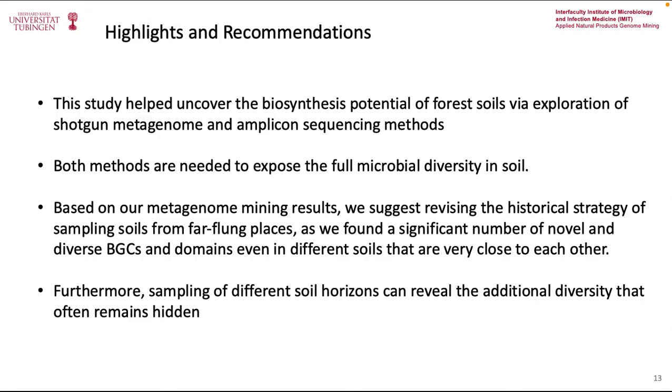So, highlights of this study: biosynthetic potential of the forest soil was uncovered via exploration of shotgun metagenome and amplicon sequencing methods to expose the full microbial and biosynthetic diversity in soil. Both methods are important and needed. And also, we feel that you don't have to go to far-flung places or specifically Bahamas to sample soils. We found tremendous biosynthetic potential in different soils and layers that are very close to each other. We also highlight the importance of studying different soil horizons, as it can reveal the additional diversity that often remains hidden.